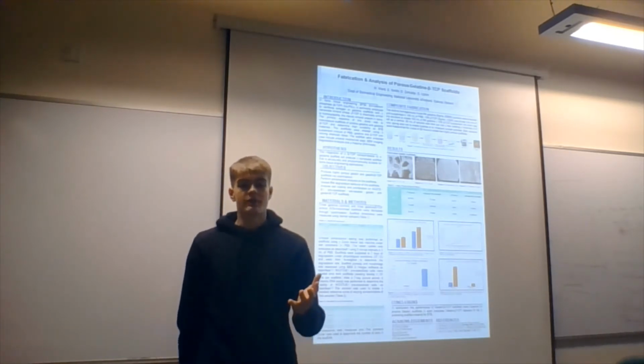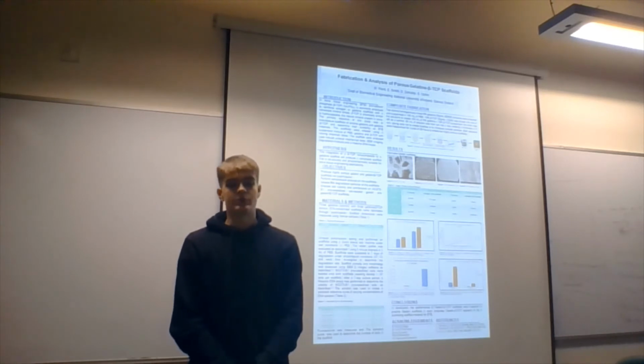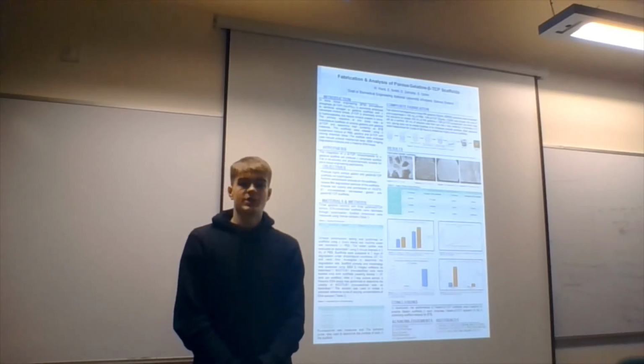Three gelatin control scaffolds and three more gelatin with beta-TCP porous and GTA cross-linked scaffolds were fabricated as follows. Gelatin was obtained from porcine skin from Sigma and was used to prepare 2 distinct solutions suspended in 100 ml of phosphate buffered saline, or PBS for short. Beta-TCP was also obtained from Sigma and was diluted into one of the 2 solutions to create 100 ml of 5% gelatin and 10% beta-TCP suspension. The other solution was left as a control.